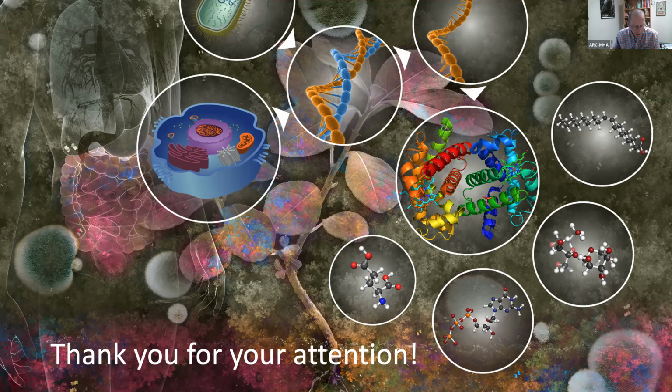So I will pop one in. I appreciated the discussion on sample prep. This is an area that, so we operate a mass spectrometry core. We've got a lot of expertise, but extracting proteins from soil is quite challenging. You mentioned the impact of different soil types. Do you have any trends as to what approach you would use for different types of soil that you might be able to pass on? Any generalizations, or is it really a trial and error type approach?